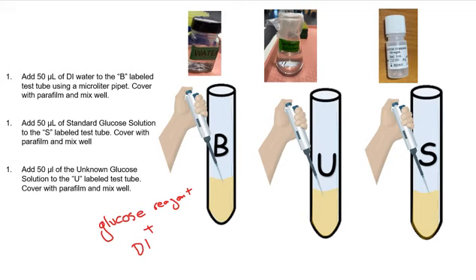We'll calibrate our spectrophotometer to ensure accurate reading. So the purpose of having the blank solution is to calibrate our spectrophotometer, so we make sure that our reading would be accurate.